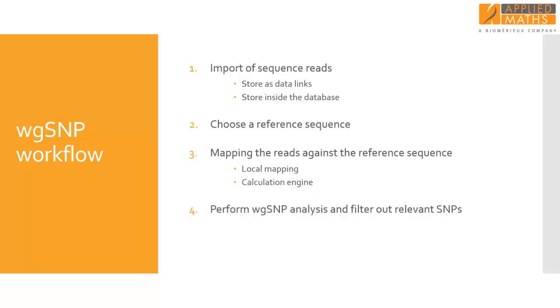Not all recorded SNPs are relevant. Some might for example be caused by sequencing errors or rearrangements. In BioNumerics, various SNP filters are available to retain only the relevant, high-quality SNPs.